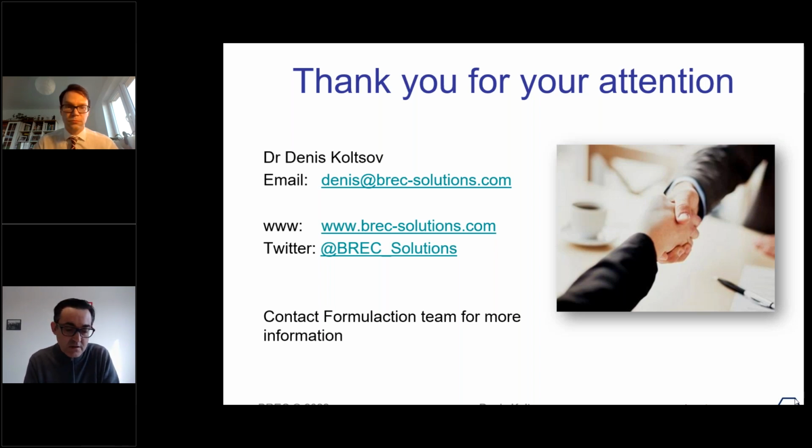One more question, Denis, was about the refractive index. I think it was behind us. Can SMLS be used for diffusive materials? I guess behind that question was titanium dioxide or highly diffusive materials. Highly diffusive material. Well, it depends. There was never really a limitation on this.